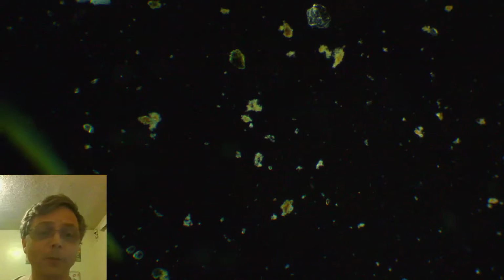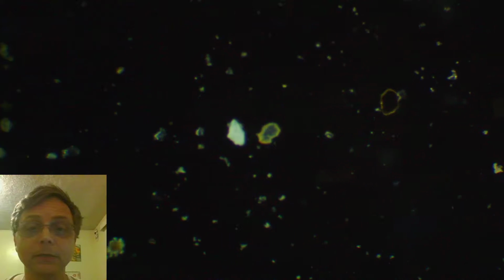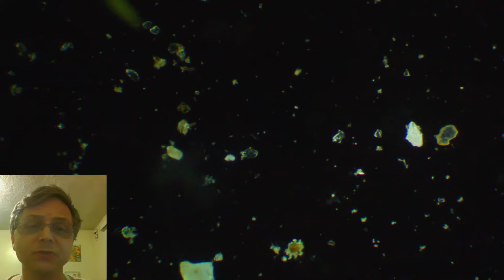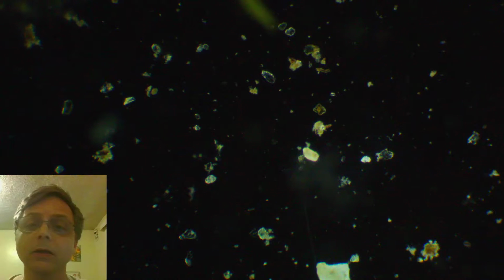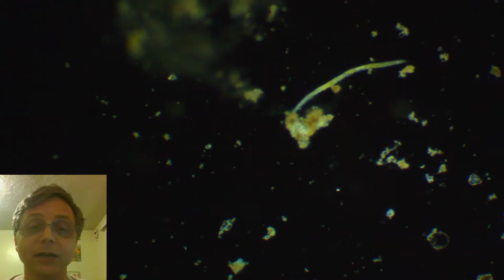I'm really looking for water bears. I haven't found any water bears yet. I'd like to see a nice amoeba, something like that. I haven't seen anything like that yet. I have seen parameciums, bacteriums, and all kinds of other things I cannot identify because I am not a scientist.